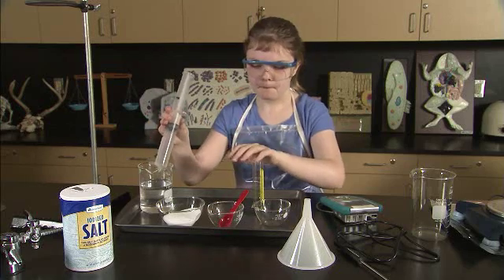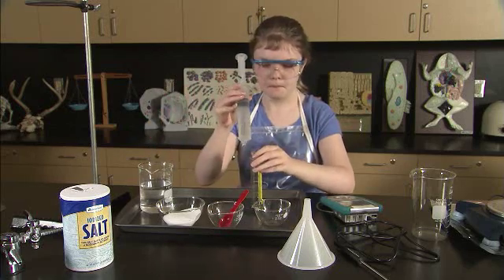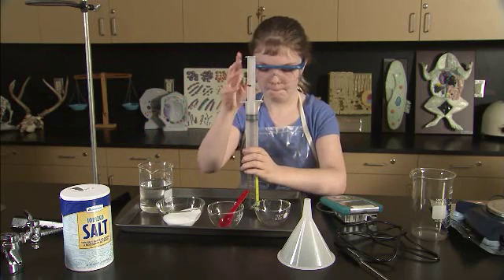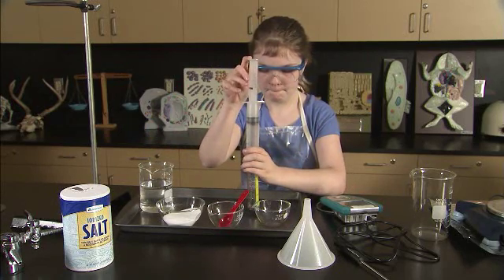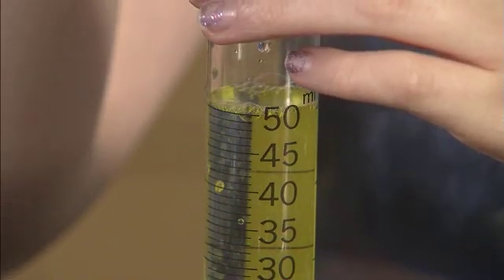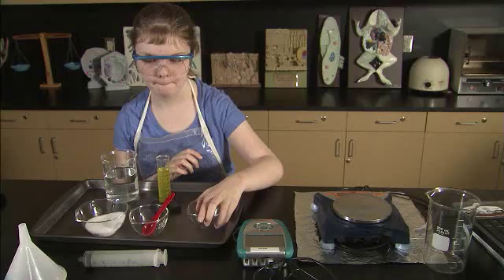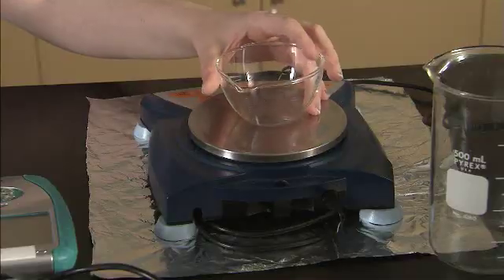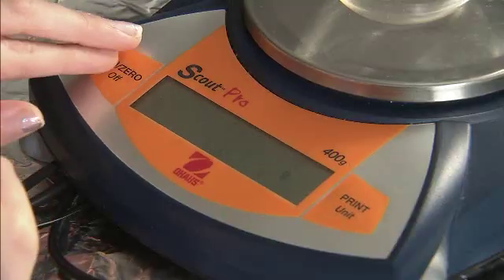Aaliyah first submerges the tip of the syringe into the full beaker and pulls the plunger back until it stops at exactly 50 milliliters. She then locates the empty beaker with one hand and places the syringe into it with the other. Finally, she empties the water into the beaker by pushing down on the syringe's plunger. The next step is to measure 5 grams of salt. An electronic balance connected to a computer running WindowEyes and Logger Pro allows Aaliyah to hear the mass announced in real time. First, she places an empty container on the balance and pushes the tare or zero button.